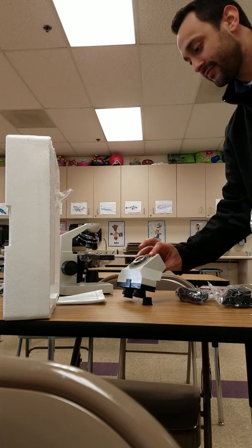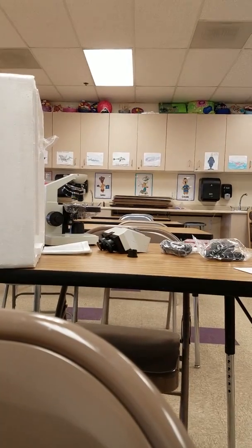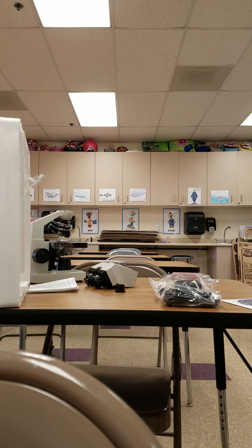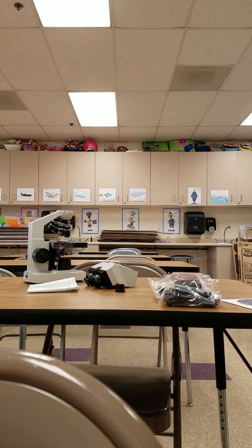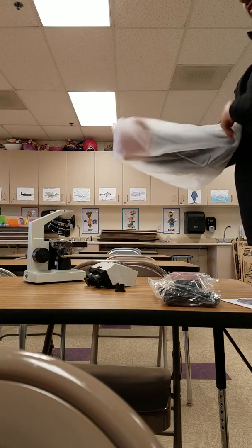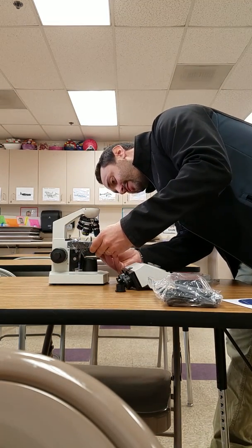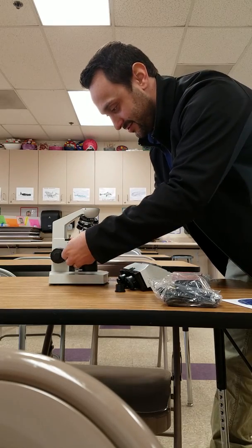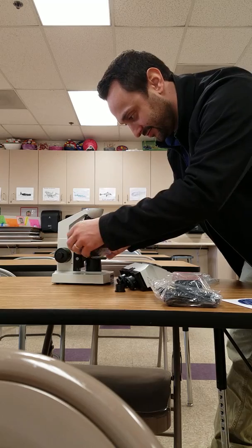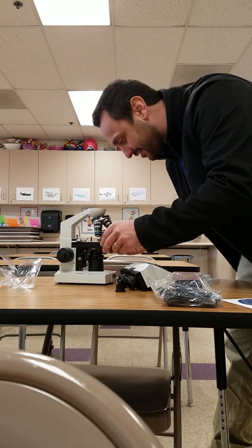We can see there's some assembly required here. Alright, so we've got a power cable, a USB cord, more garbage. And I'm guessing this is some kind of dust cover. Very nice, very nice. Oh my gosh, it's like Christmas — it's beautiful. Let's get all that stuff peeled away.